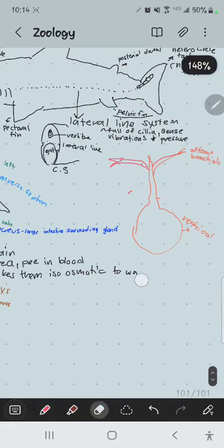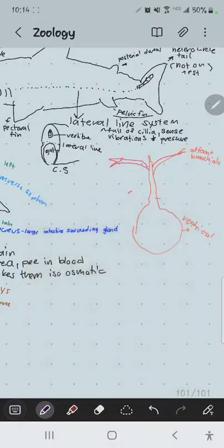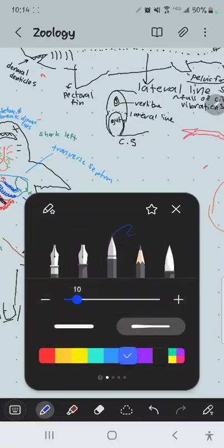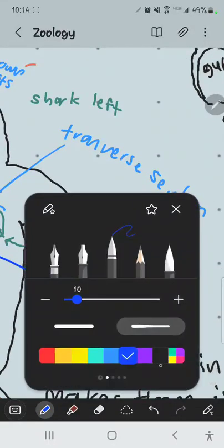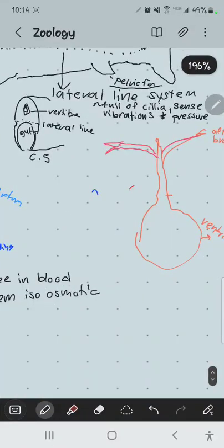The reason I'm pointing it out is we're going to see this shark has essentially a two-chamber design. There is an atrium and a ventricle, just two muscular chambers. When we see the frog, there's going to be a three-chamber design: two atria and one ventricle. Just to spoil the punchline, the sinus venosus becomes the second atrium, or the right atrium. The sinus venosus is already there, it's just that the atria orient sideways. This becomes the right atrium, and that becomes the left atrium in the frog. But take a look to see if you can find that. But this is a two-chamber design.